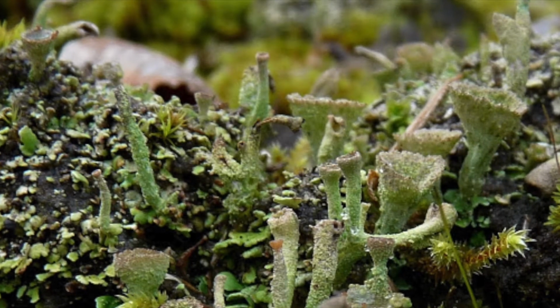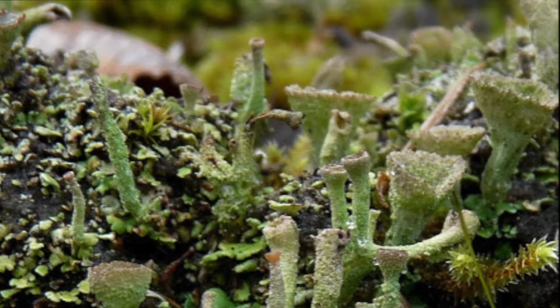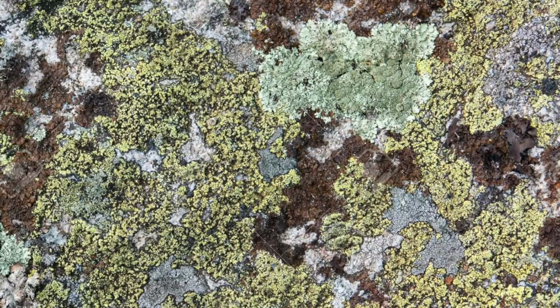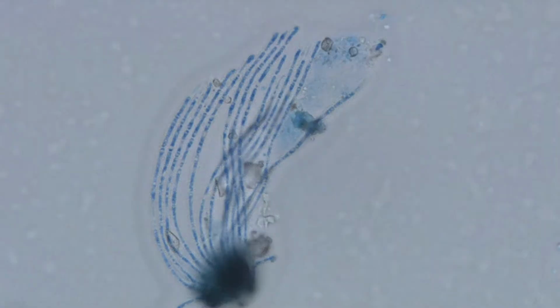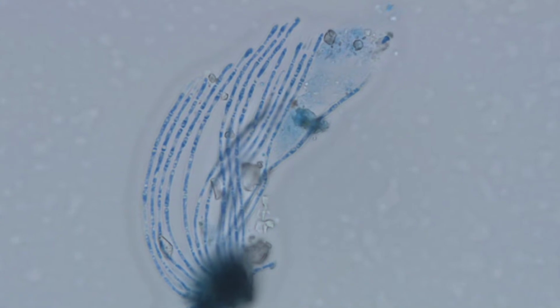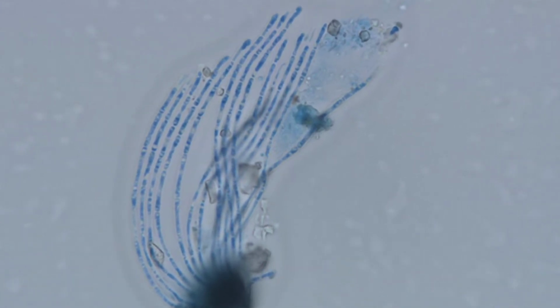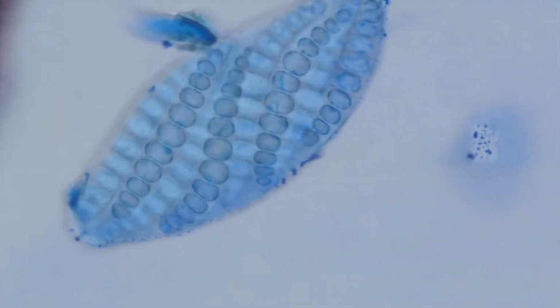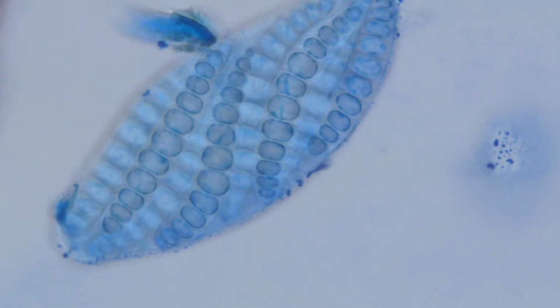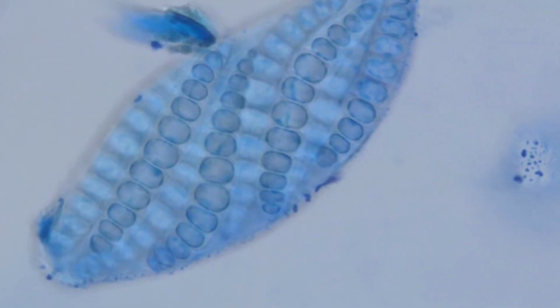With the aid of Lottie Stevens, we have prepared this short video to demonstrate the use of Mark Powell's ink vinegar staining method for staining lichen-related structures. The results of the ink vinegar staining method shown here can be used to aid the study of the anatomy of the intact lichen, for example the apothecia, or to examine isolated structures such as the spores or paraphyses.